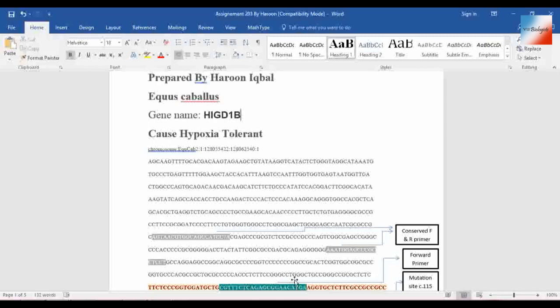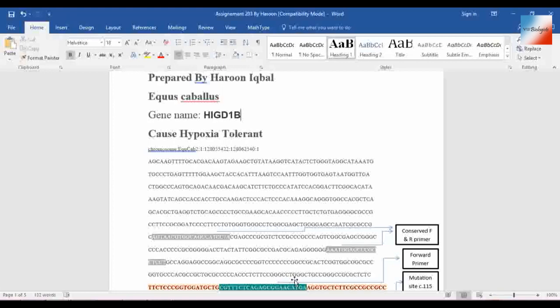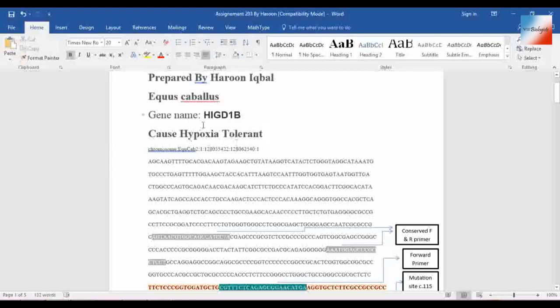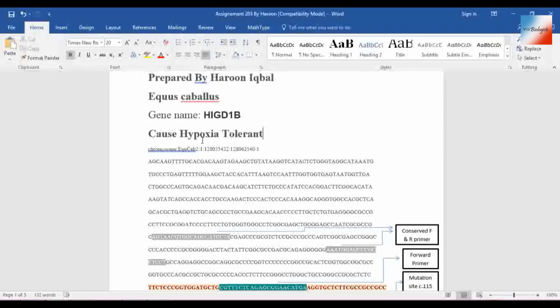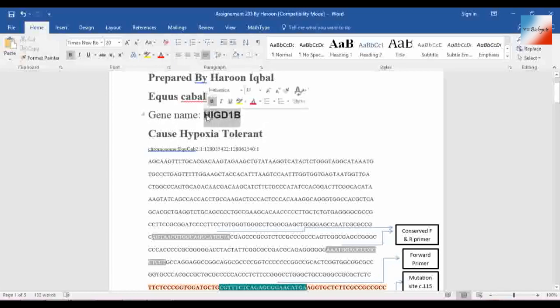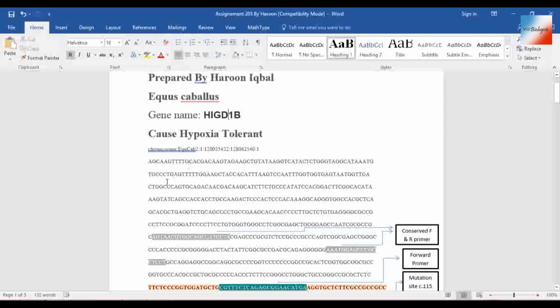Equus caballus is the scientific name of horse, and I'm looking for the hypoxia tolerant gene. Sometimes we don't know about the gene name, and that's okay. My gene name was HIG-D1B. So let's start how to get sequence from NCBI or Ensembl.